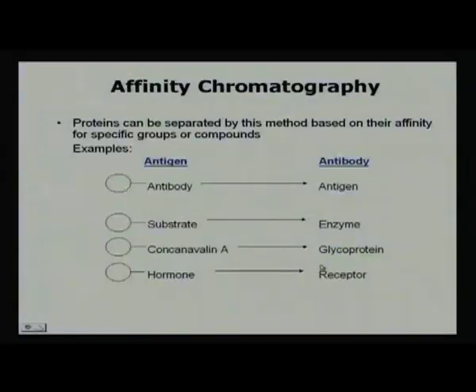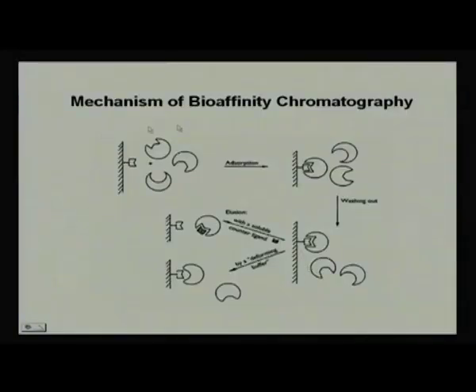So, these are the simple principles of affinity chromatography. This affinity is nothing but the inherent biological property of biological macromolecules. This is the mechanism of bioaffinity chromatography.